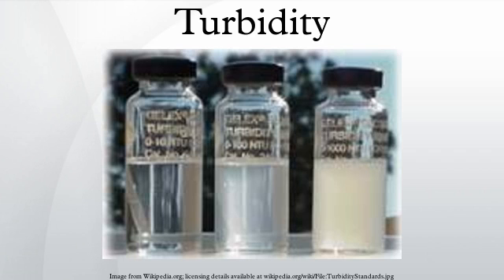Fluids can contain suspended solid matter consisting of particles of many different sizes. Whilst some suspended material will be large enough and heavy enough to settle rapidly to the bottom of the container if a liquid sample is left to stand, very small particles will settle only very slowly or not at all if the sample is regularly agitated or the particles are colloidal. These small solid particles cause the liquid to appear turbid.